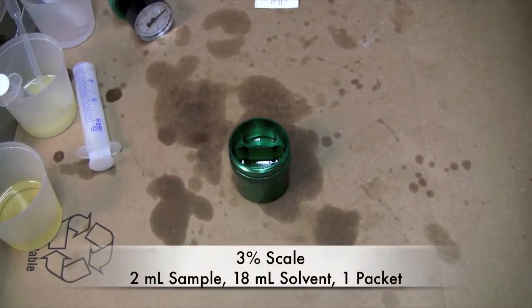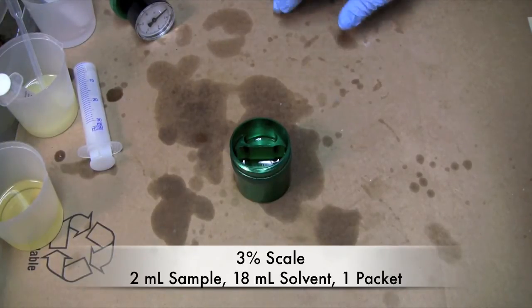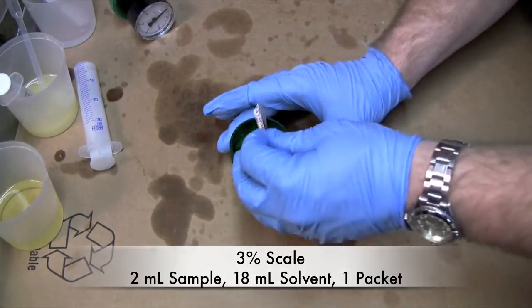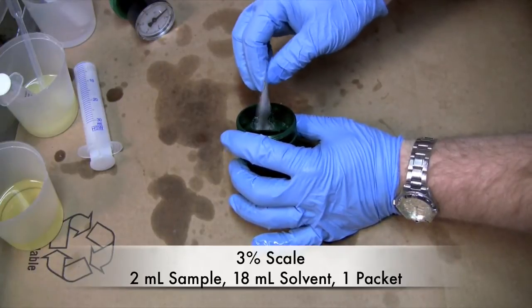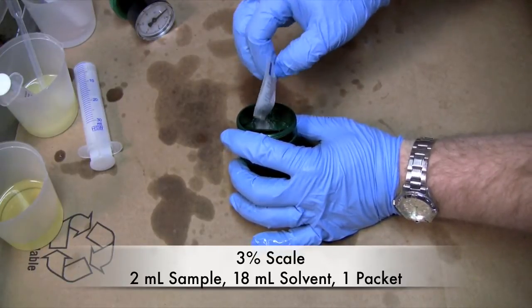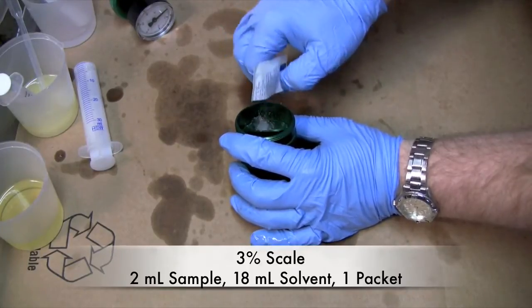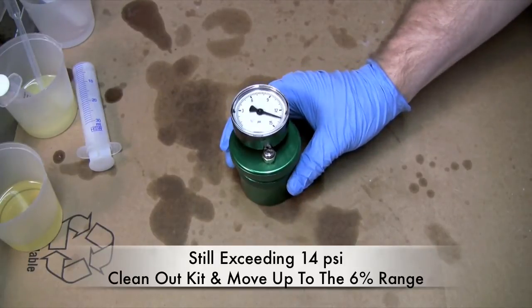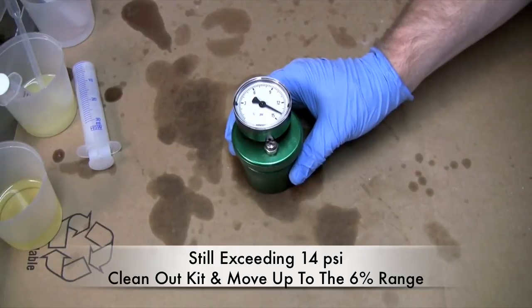We've now moved to the next step up. It calls for 2 milliliters of our sample and 18 milliliters of Reagent B, then put our little catalyst in. It says to go ahead and put the top on, take a new reading, and see what you get — and it's got a conversion chart for us. As you can see, this one is also going to pass 14, so that means we now need to move up to the next step, which is the 6% range.